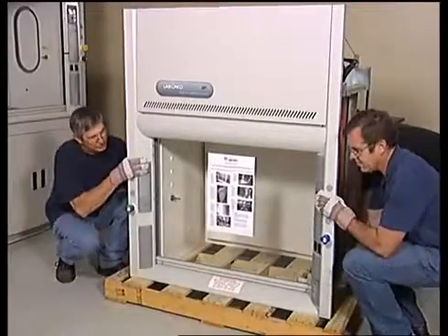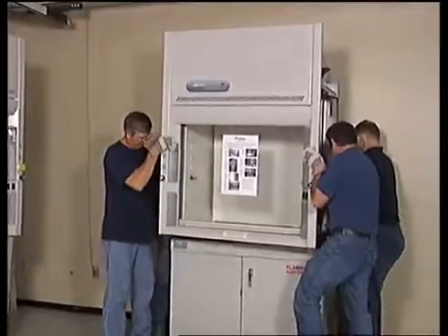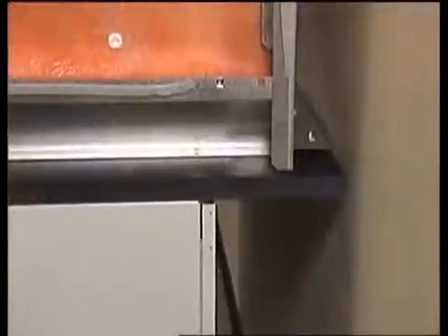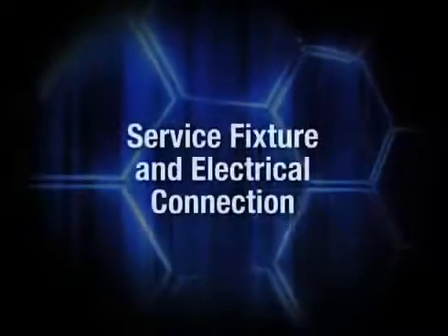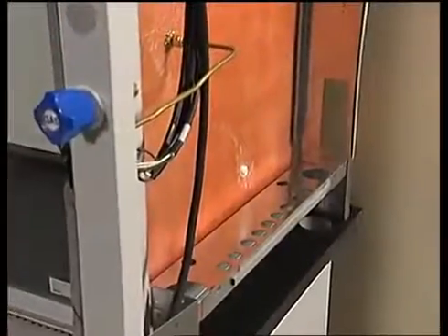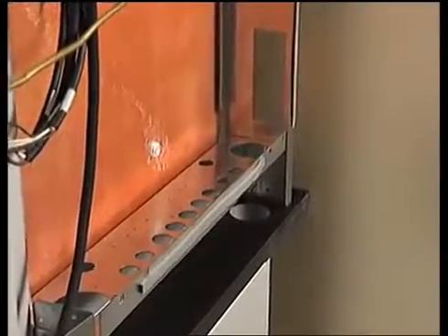When lifting the hood superstructure, hold the hood only by the side rails and back to avoid any damage to the hood. Do not lift the hood by the airfoil. Place the hood so that the rear angle is flush with the back edge of the work surface. The remaining overhang at the front allows for proper air flow. Adequate space is provided behind the base cabinet for routing of utilities and service connections. You can direct inlet tubing to the service fixtures through the openings on either side of both the hood and work surface.